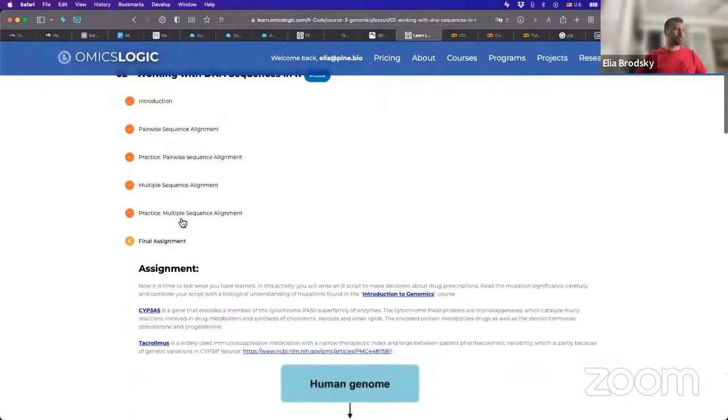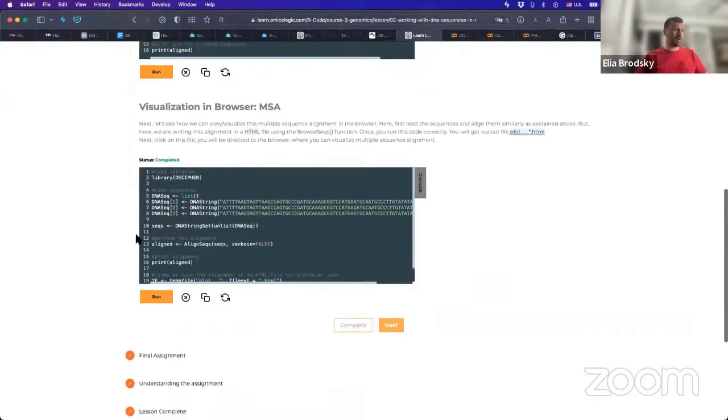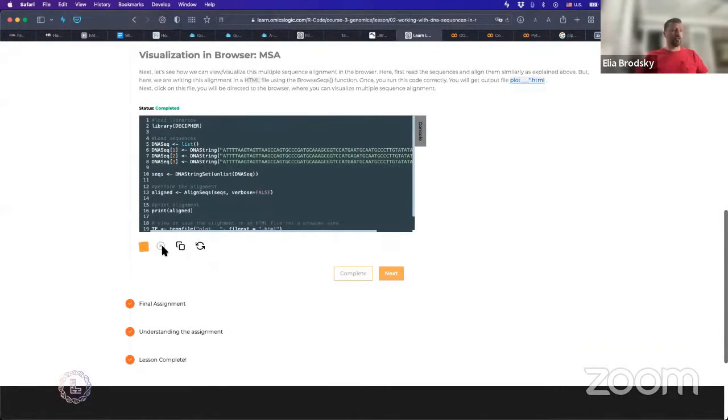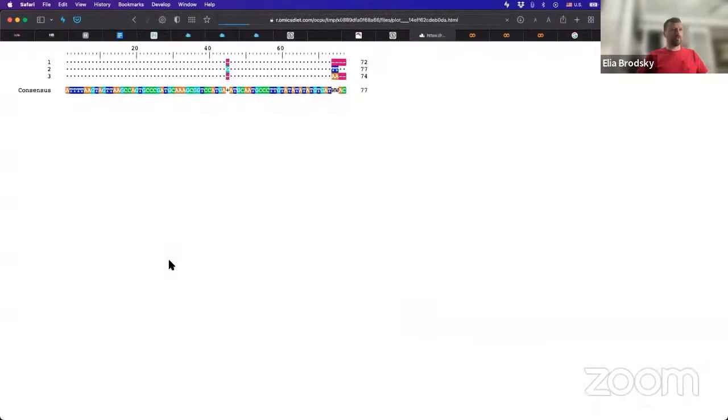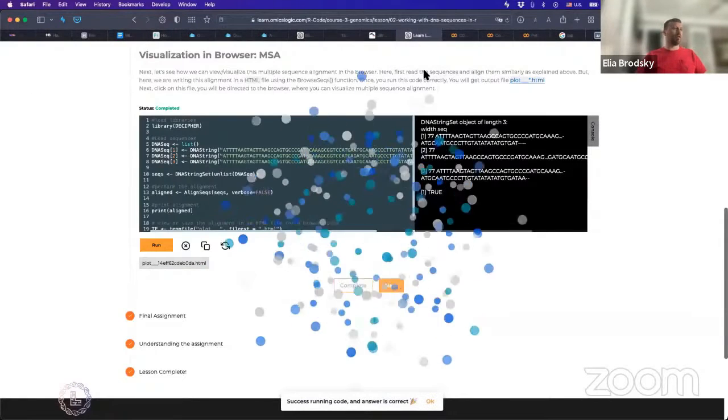And I'll just show you the practice example right here to understand the actual visual representation of those sequences. Okay? And this is a visual representation of multiple sequence alignment.